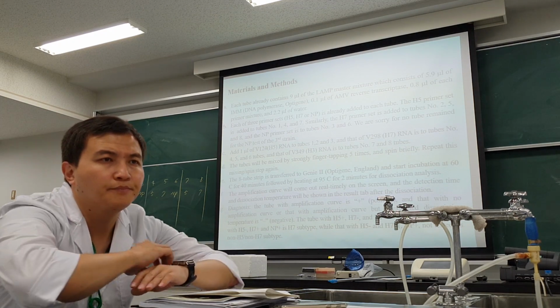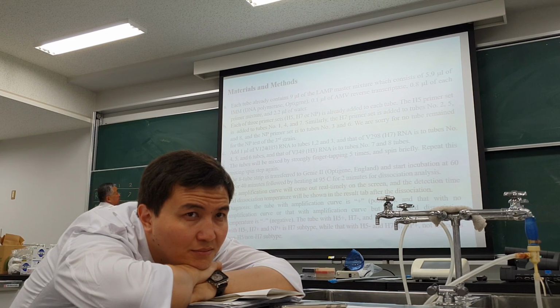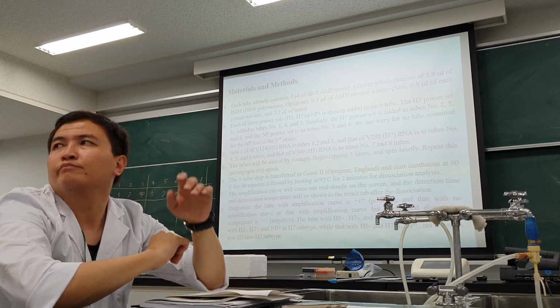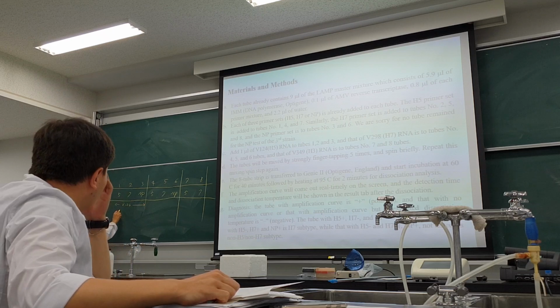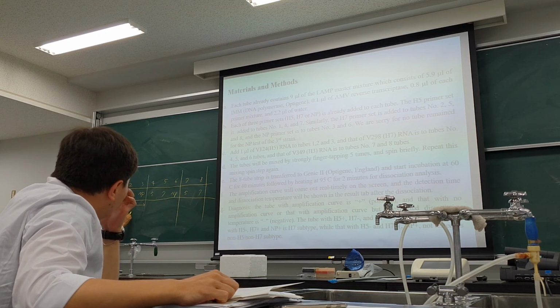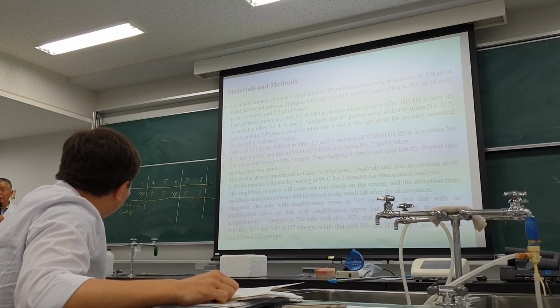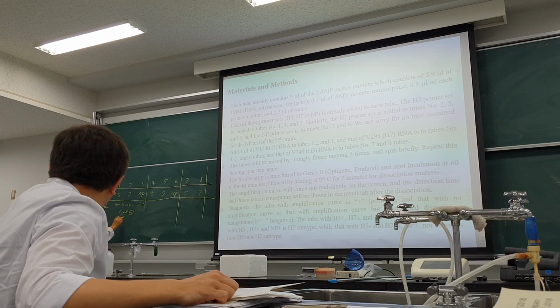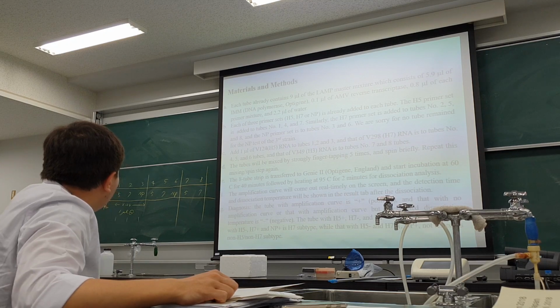Do you understand? Okay, for the RNA sample, add 1 microliter each. Change the tips, okay, microtips. 1, 1, 1, that's 1, 1, 1. Okay, 30, and after mixing, start the incubation.